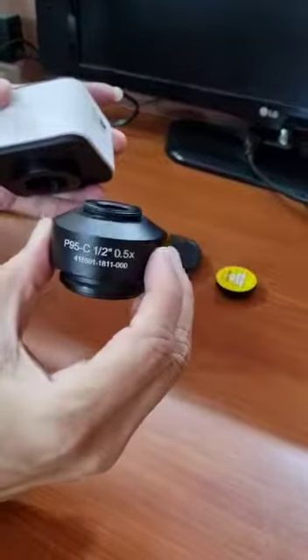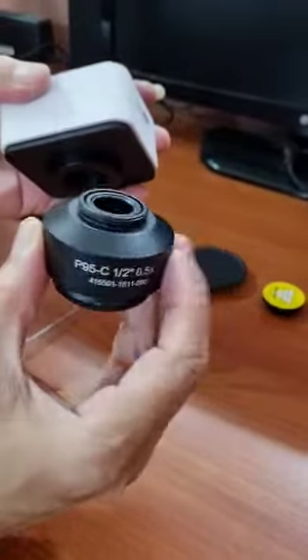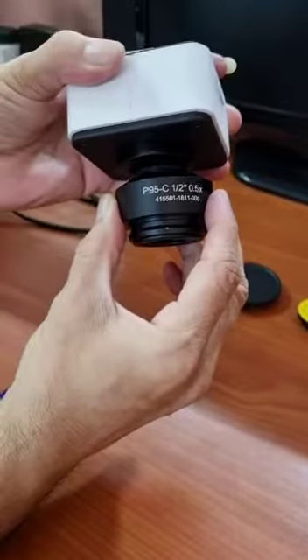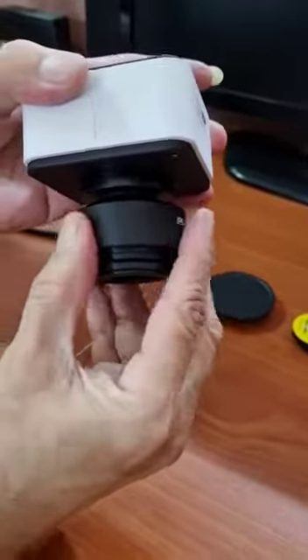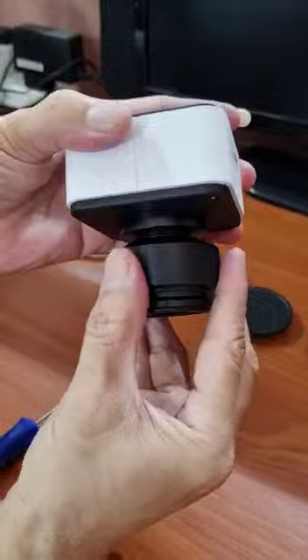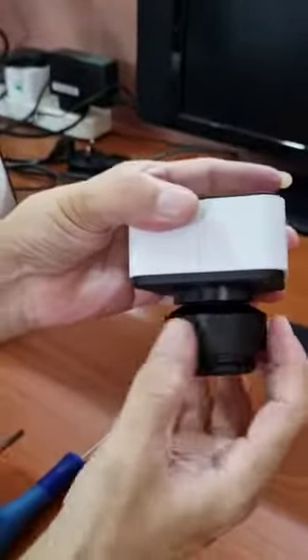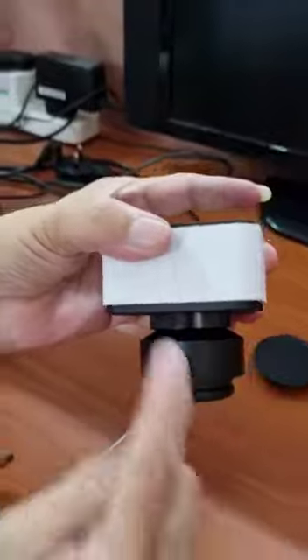Hold the C-mount adapter in your right hand. This is the C-mount threading. Keep threading it clockwise until it goes fully in. This is how the C-mount adapter is fixed to the camera.